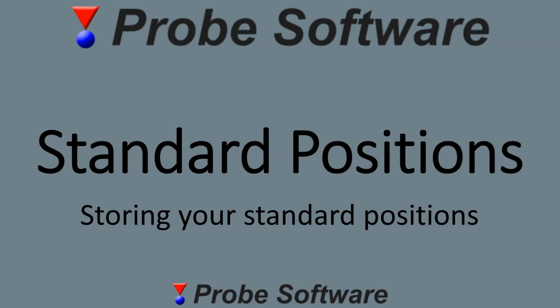In a previous video, we looked at how to store the compositional data for our standards. In this video, we're going to look at how to store the positions of our standards so that we can make them easily accessible when we're doing analysis.